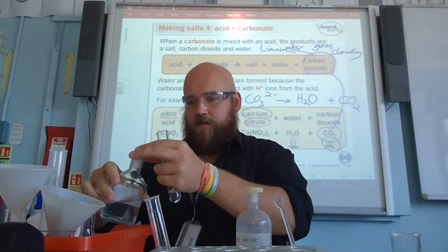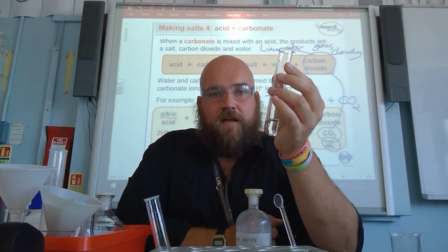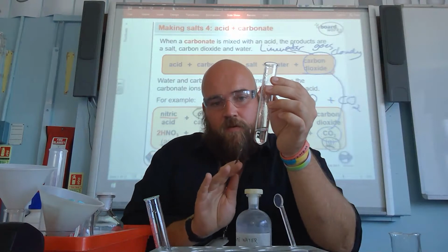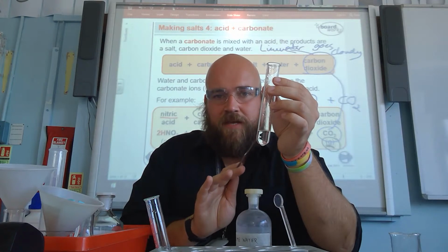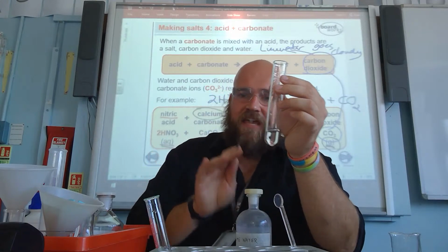And again, I'm going to add a carbonate to it. Okay, so let's imagine I'm adding calcium carbonate to it. Okay, and two things you'll see. One, you'll see effervescence or fizzing, as you might call it, and then you hopefully see the solid disappear as well. But how am I going to get the gas from here into there?